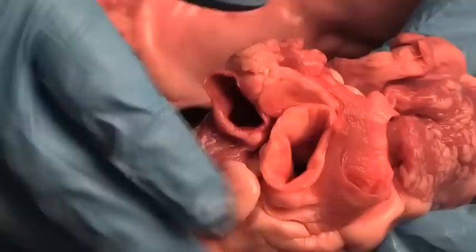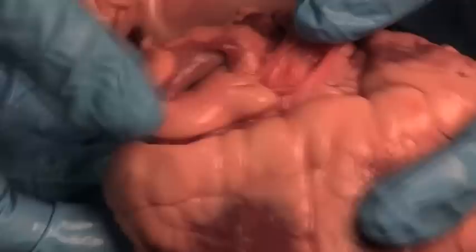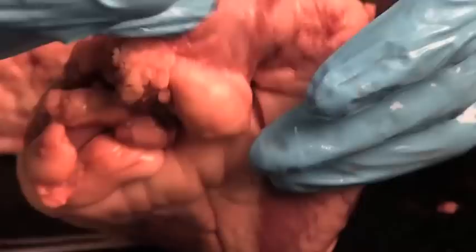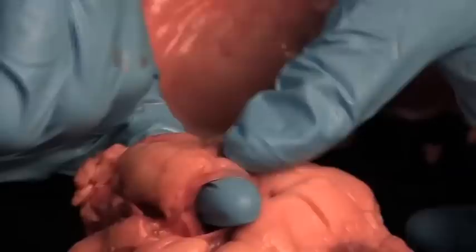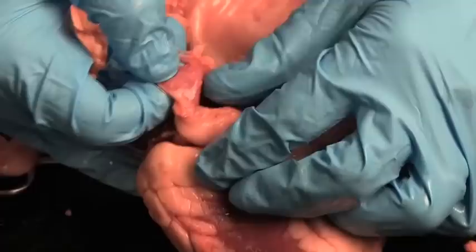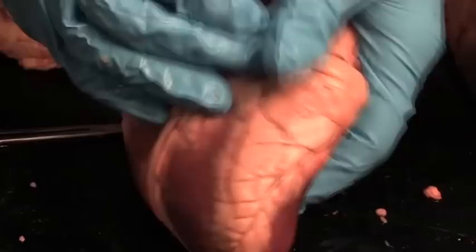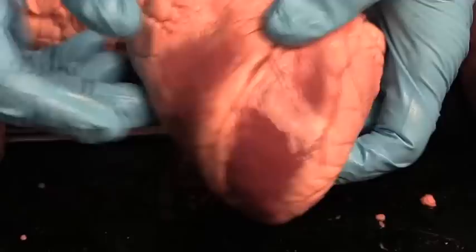Behind the pulmonary trunk is the aorta, which pumps blood from the left ventricle out to the body. If we turn the heart around and look at the back side, you can find the veins. On the left side, you'll see the opening for the superior vena cava — stick your finger in and it winds up in the right atrium. Keep poking through and you come out the opening for the inferior vena cava. Over on the left side is the opening for the pulmonary veins bringing blood back to the heart from the lungs into the left atrium.